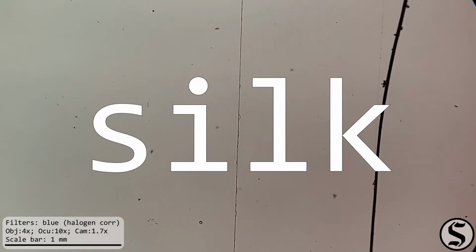So on to the other fiber. This one is spider silk. Silk comes from the Greek serikos, which itself is probably an Asian loanword. Now, the type of spiders that we have in our house are jumping spiders. And they don't produce webs to catch things, but they do use these drag lines sorta for spider spelunking, so they can get down from high places.